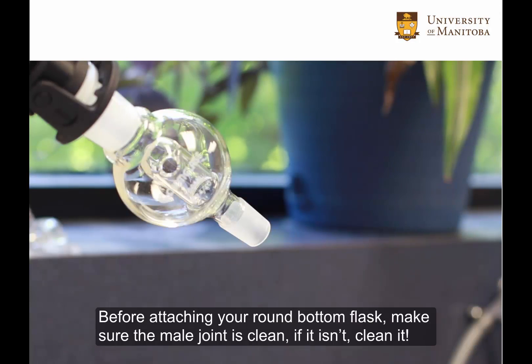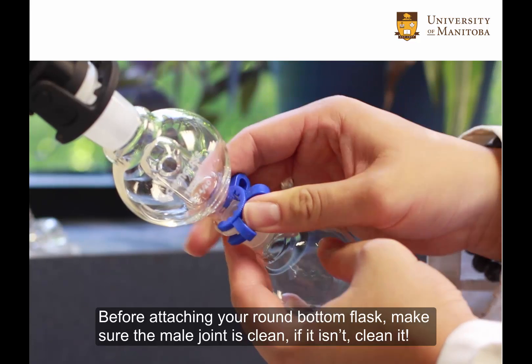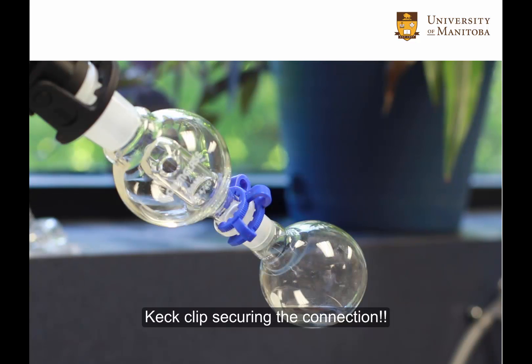Before attaching a round bottom flask, make sure the male ground glass joint is clean. If it isn't, clean it. Attach the flask and then secure it with a keck clip. Do not leave the round bottom flask connected without the keck clip securing the connection.